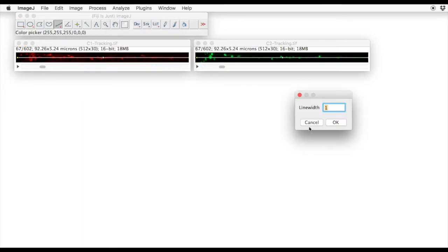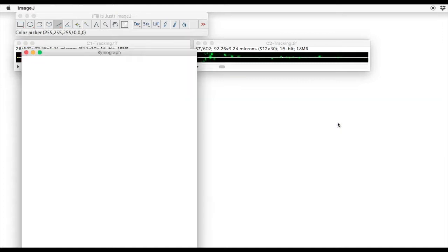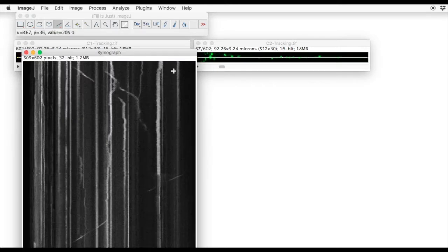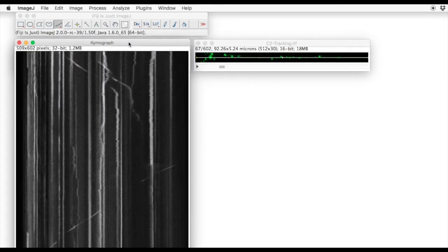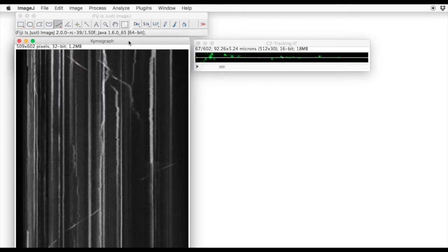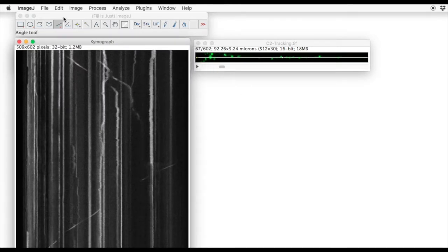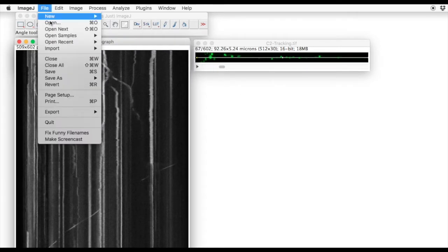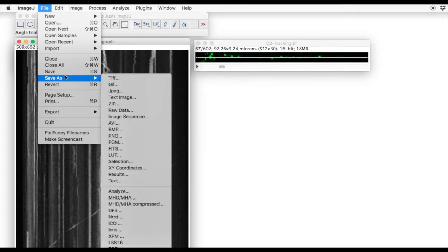This then allows us to define the number of pixels that we want to analyze over. In this case, our image is 30 pixels wide, so we choose 29, and this gives us a kymogram readout over time.